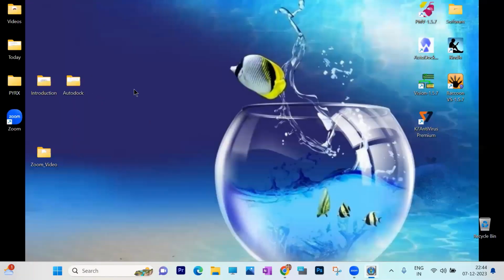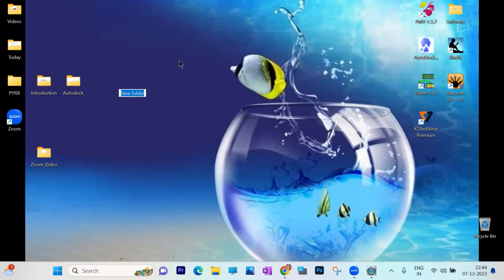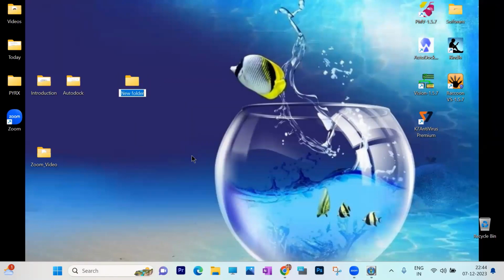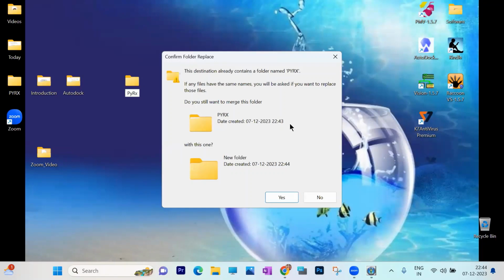Okay. So here what you do, first I will create a folder, and I will rename it as PyRx. Okay. So I am giving it as P Y R X. So we are going to work it as PyRx.